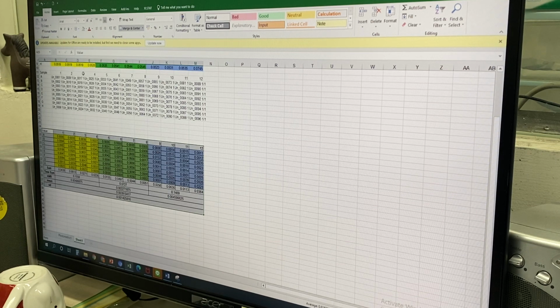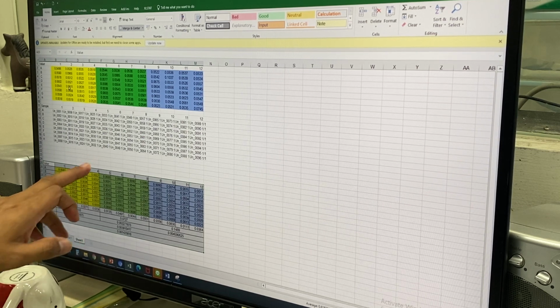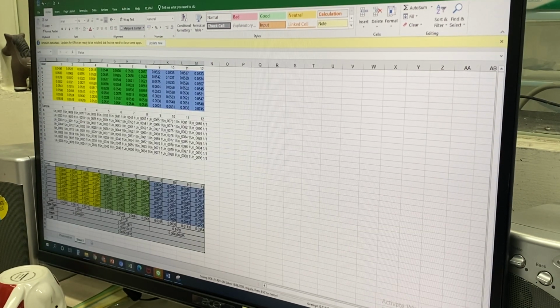Okay. So this is your 24 hour reading, right? So you will take again a 24 hour reading, which means 48 hours, because you have to take the readings on this Ecoplate at 24, 48, 72, 96. So you can calculate this one, okay? One sample has 7 different readings. Now if I finish this calculation, how do I draw it? I'll tell you.